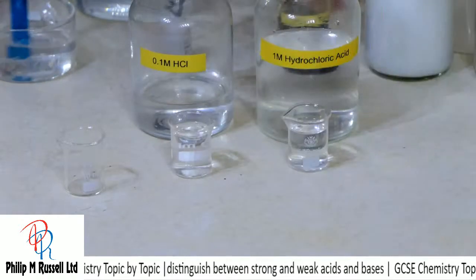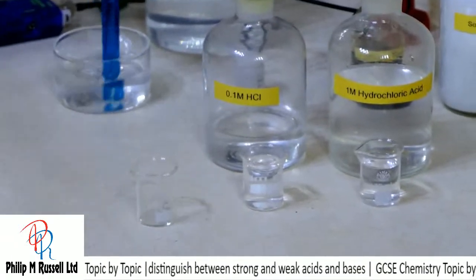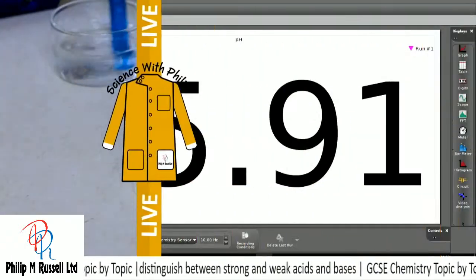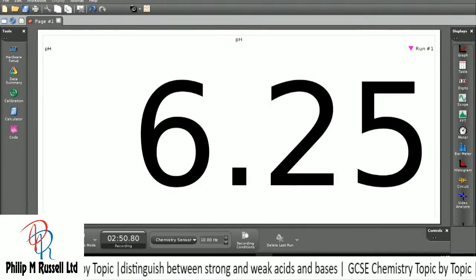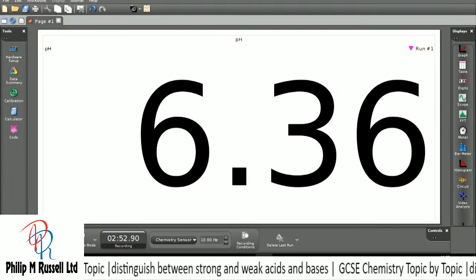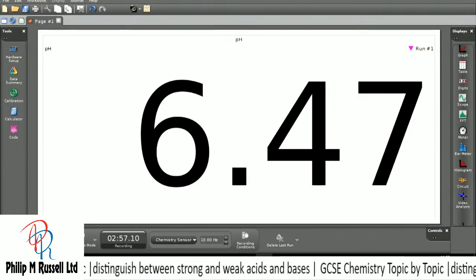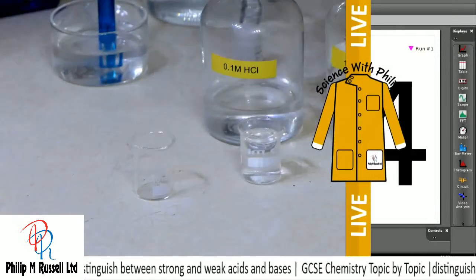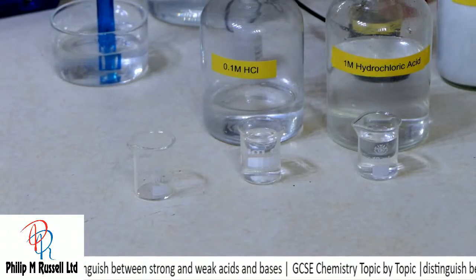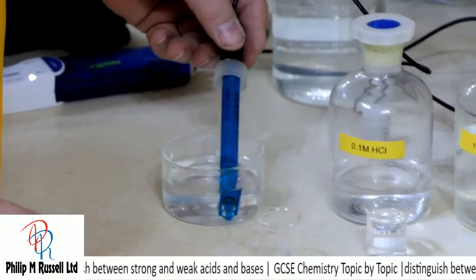Right, I'll clean it and put it back into water, and you'll see the pH will rapidly turn back to about 7. Now it won't fully do that because I've got some hydrogen ions in my little container here.